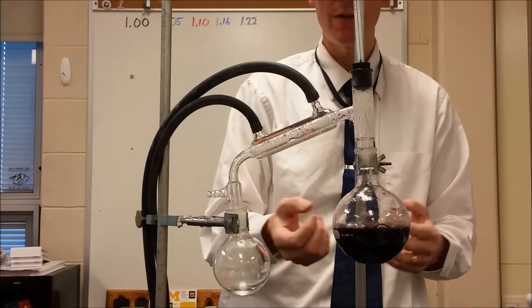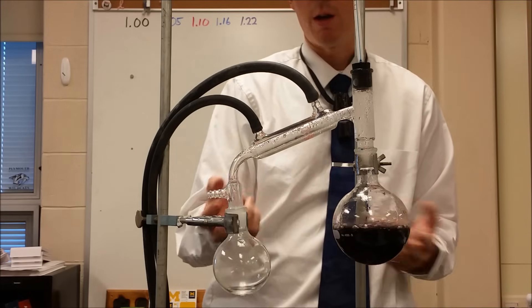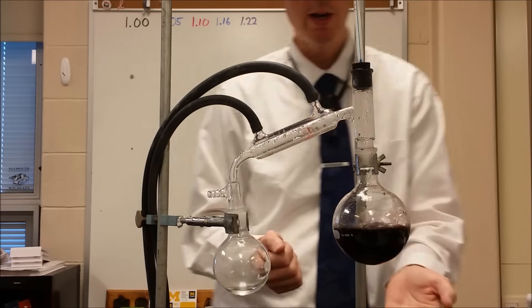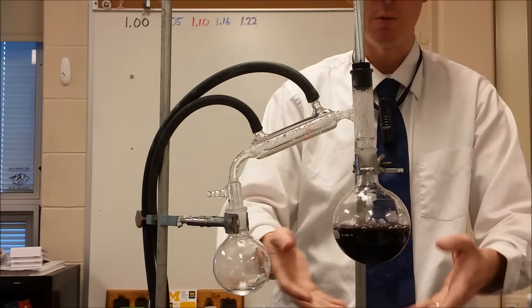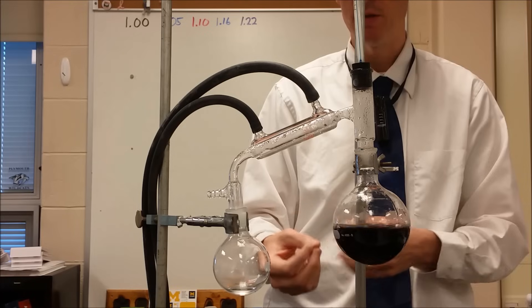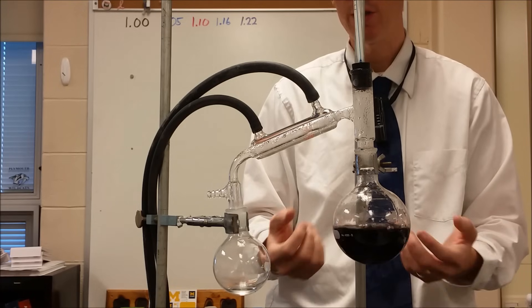So we're doing a separation here based on boiling points and that's how this apparatus works. The trade-off with this is that it takes a lot of energy to boil the water, and so therefore this is not a good means to do a separation on an engineering large scale.